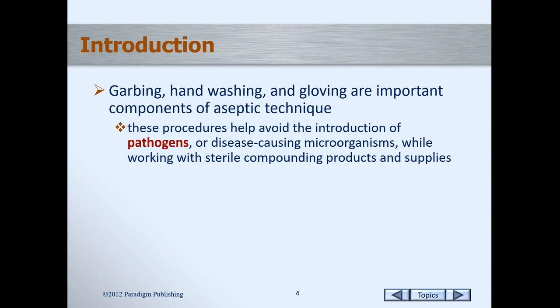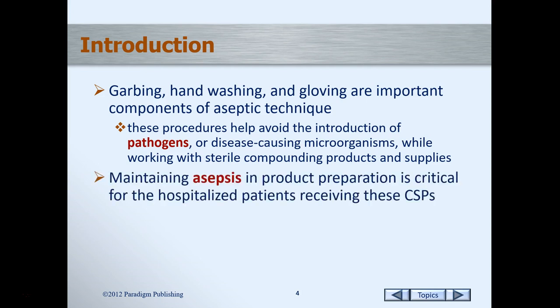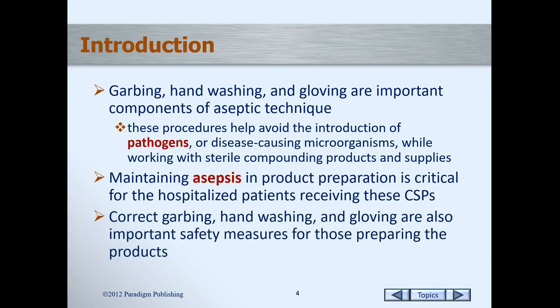Aseptic technique begins before the act of preparing the sterile compound. Proper garbing, hand washing, and gloving help to avoid introducing pathogens to the sterile products. Sanitation, cleanliness, and infection control are more of a modern thought process. Many concepts introduced in the 1800s have continued to evolve to the standards we observe today. Current sterile attire reduces incidences of nosocomial, which is hospital-acquired, hospital-borne, or healthcare-associated infections.